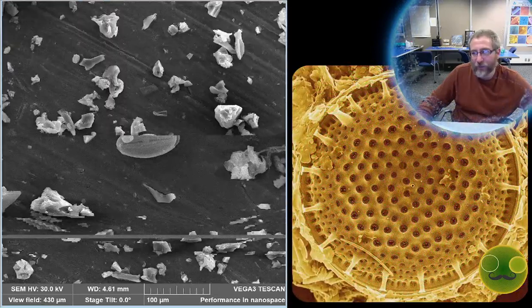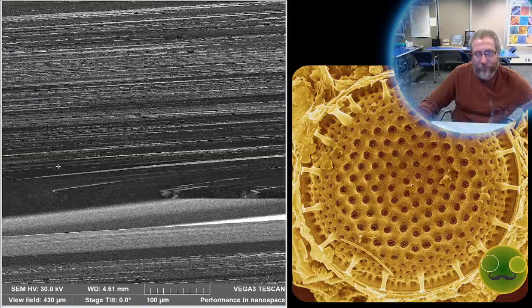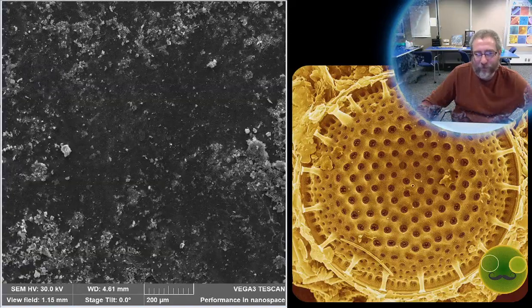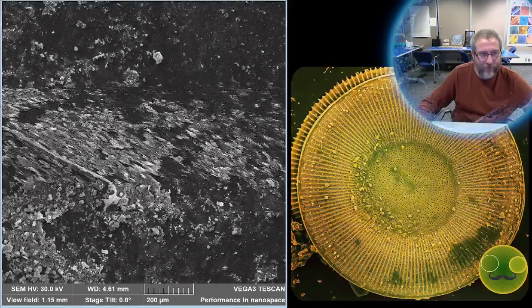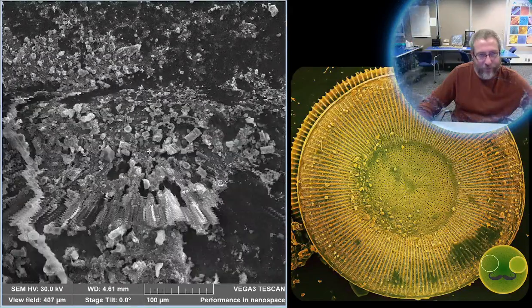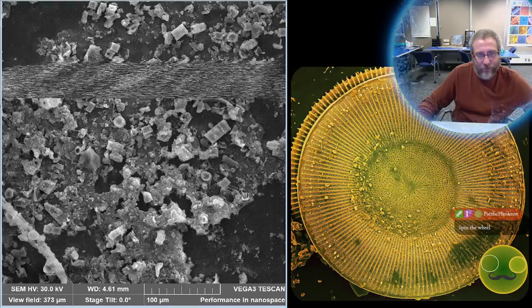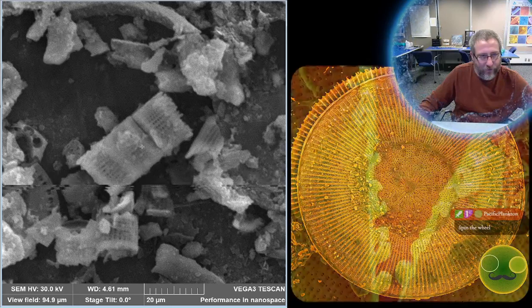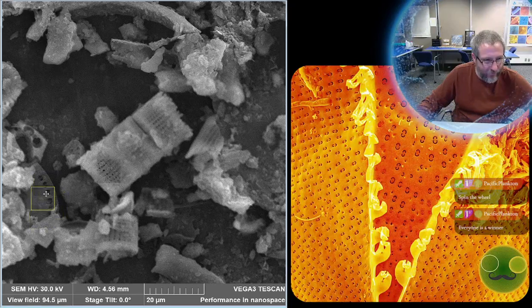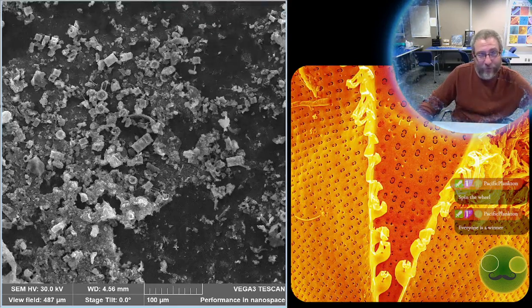All right, let's jump over to another sample. We'll spin the wheel, go around to sample 5, and see what's in this one. This is some more diatomite. It's from the same kind of material, but a different site. And you can see it's all full of a bunch of little Aulacoseira. That's these things here that are like little tiny beer can shapes. Here's a valve view of them. This is a girdle view of them. And these are pretty typical Aulacoseira for this time frame, in terms of the shape. And then there's a little cyclotelloid, which I hope to find. Something that's not covered with junk that looks like that would be good.